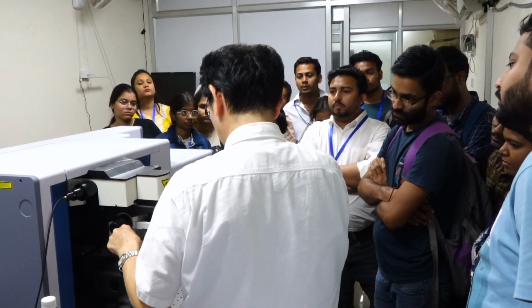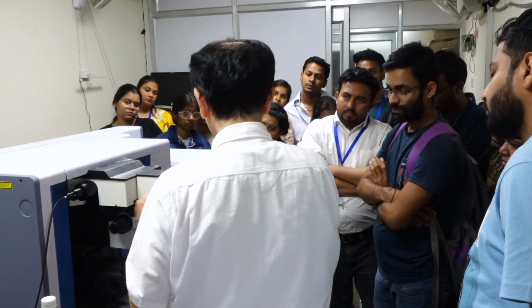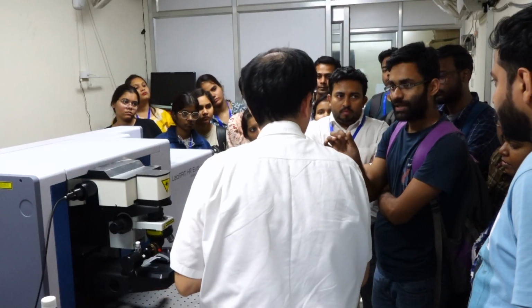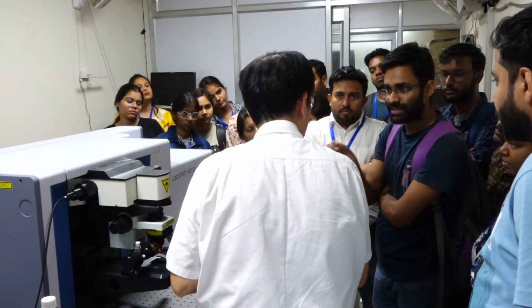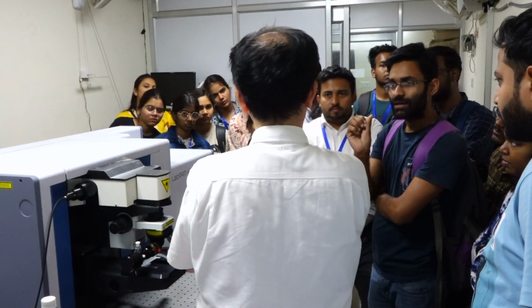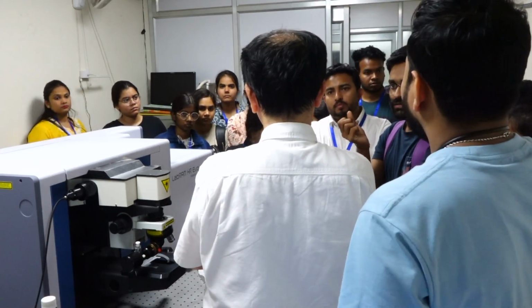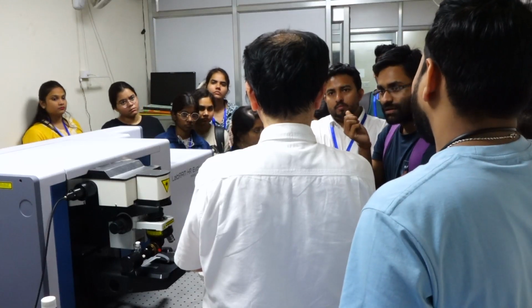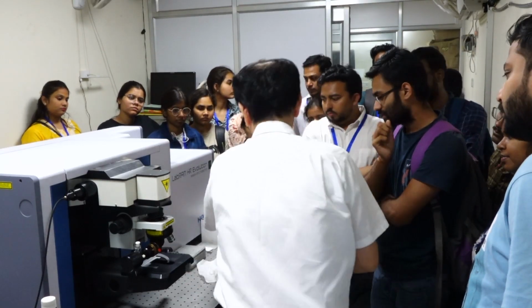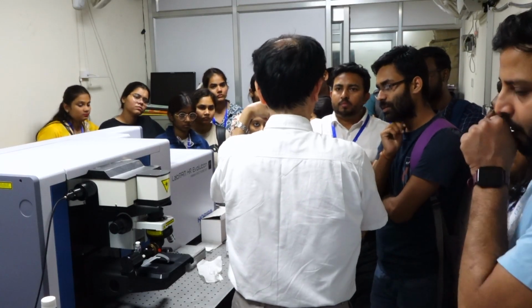Okay, today's sample is in a cuvette. So how do we prepare the sample, if there is a solid or gaseous material? Generally speaking, in this case, we dissolve the sugar in the water, and this is the sample.